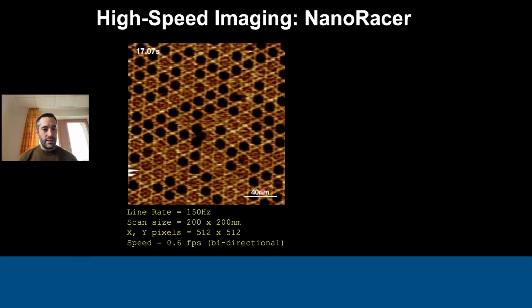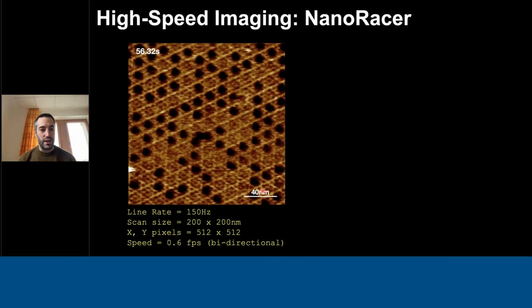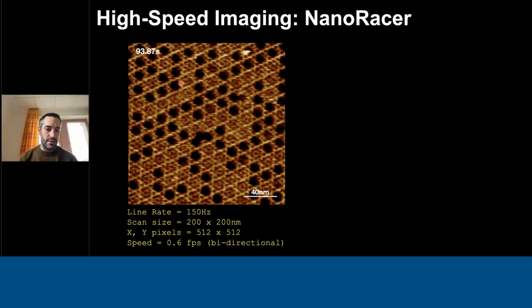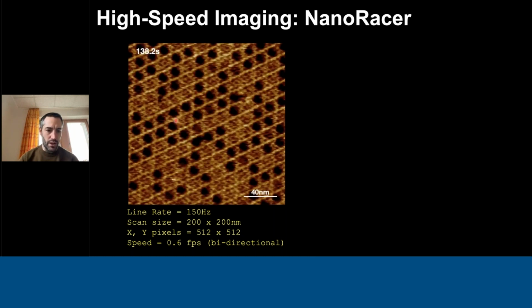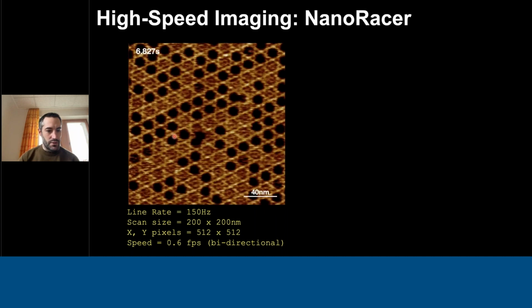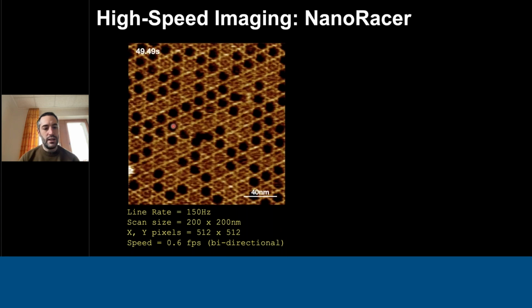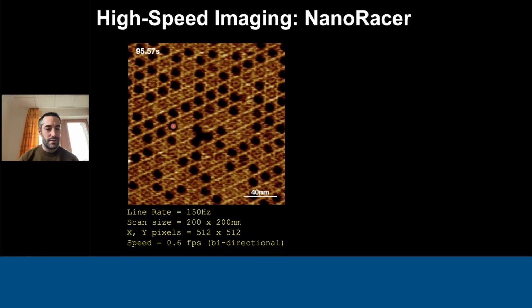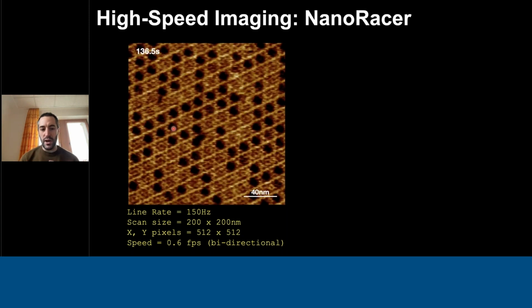This is quite a nice system that we found when we got the nano. And you can see here that this is just after it's been assembled into a 2D lattice, you have this kind of hexagonal lattice of triangles here, and then in the center there's like an opening that allows a trimer to sit in to the lattice, not strictly part of it.